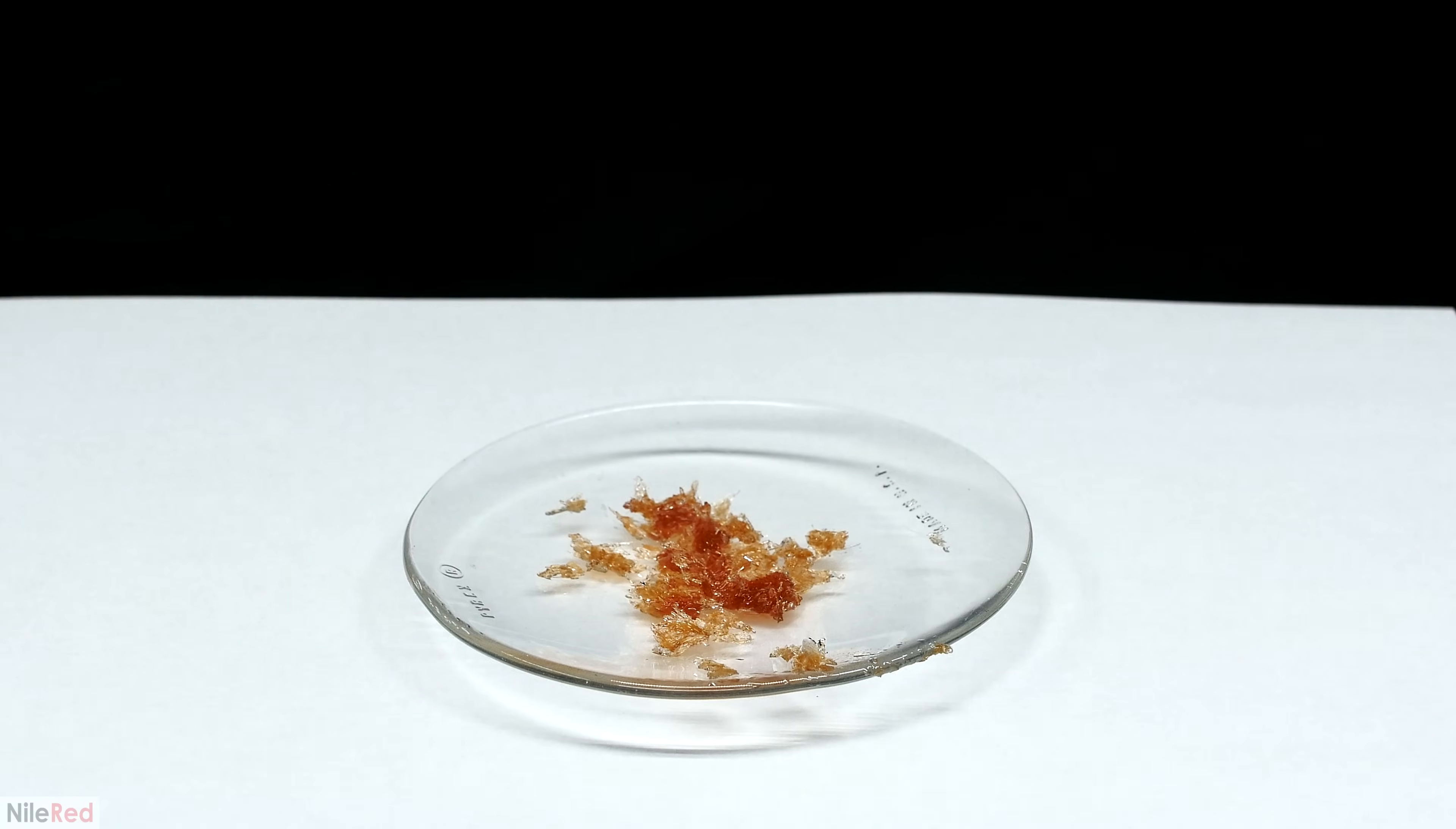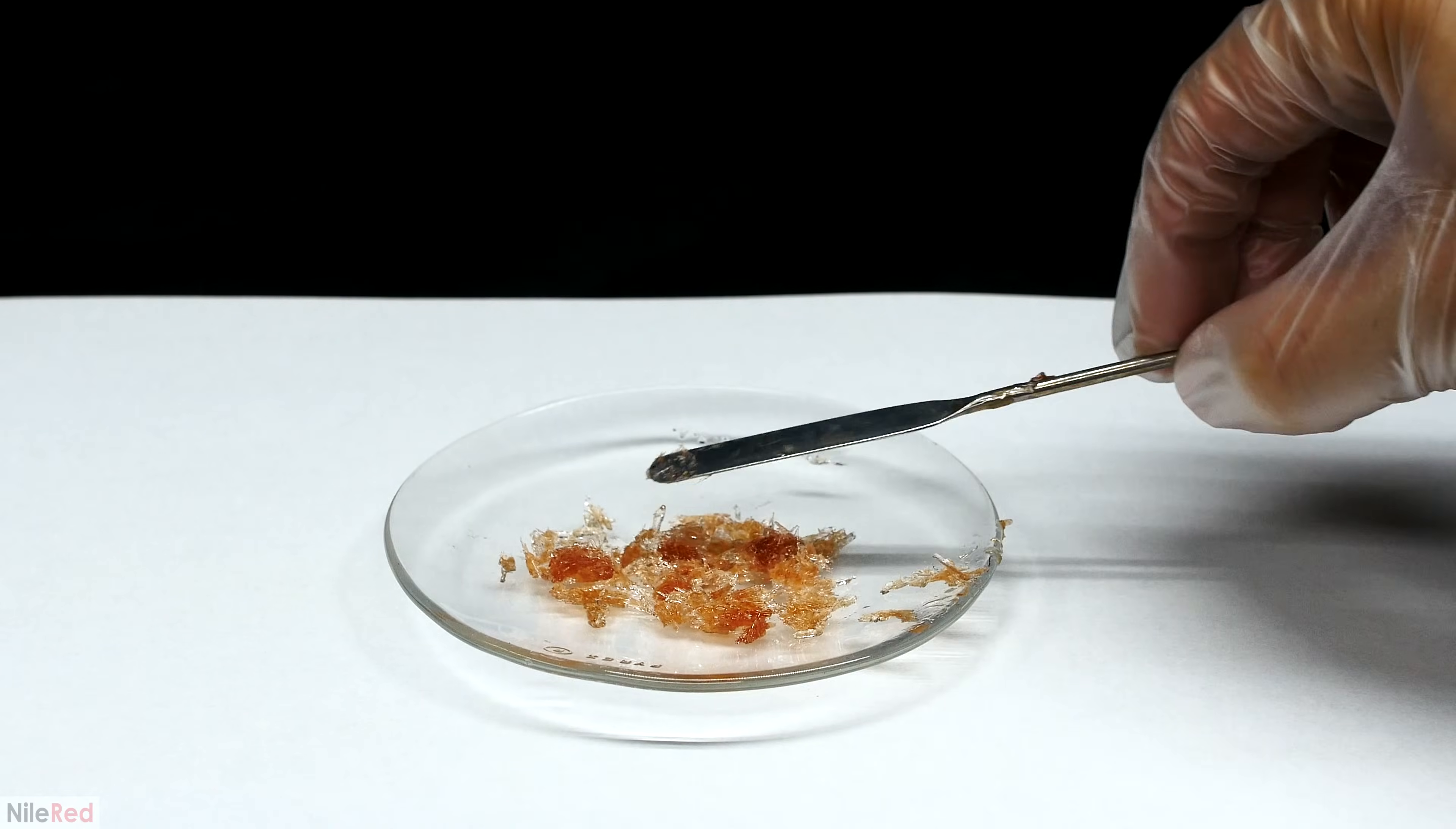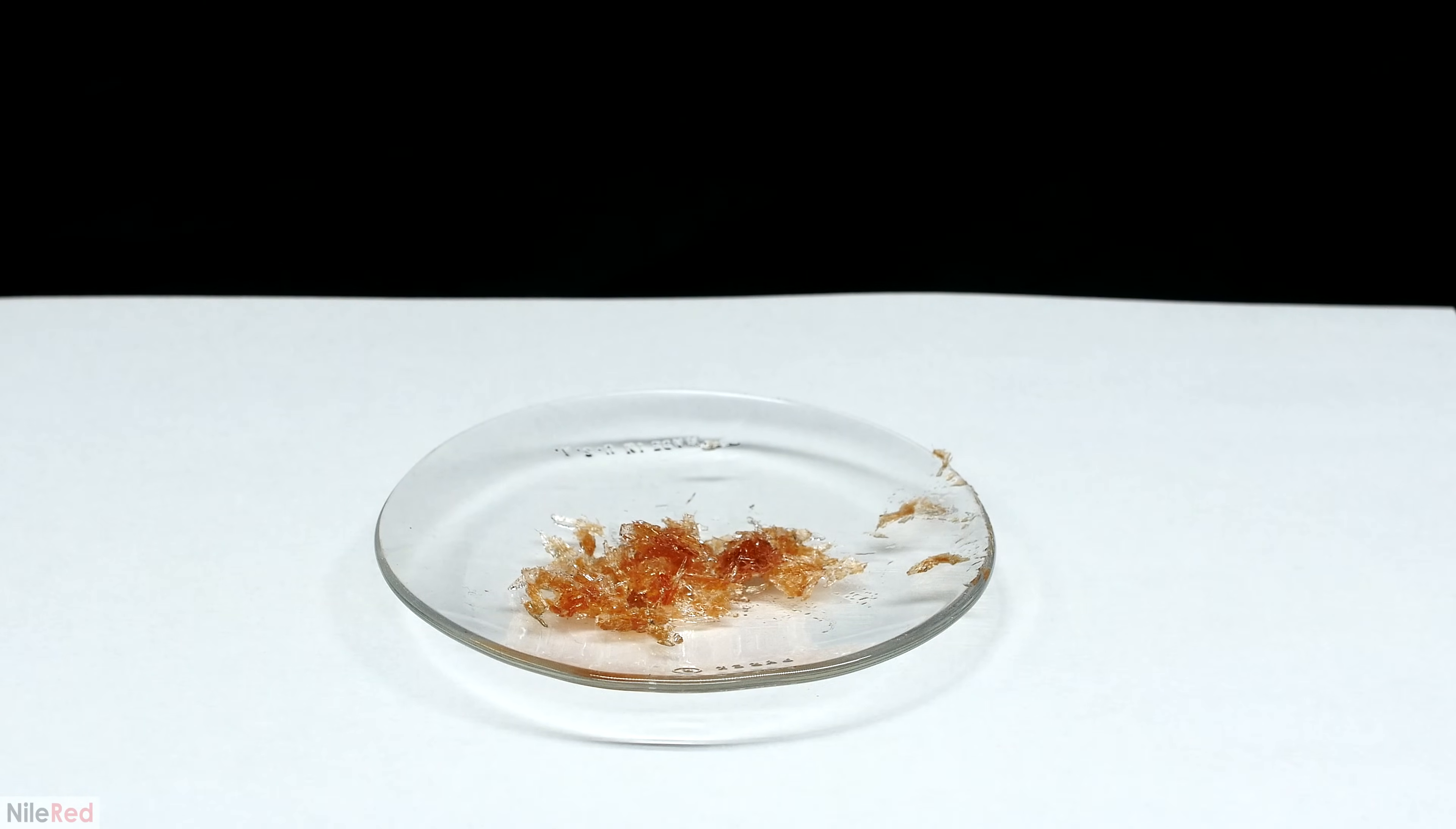Just by the color of the phenol that I have here, it's pretty easy to tell that it's heavily contaminated. The brown color indicates that we have polymerized phenol present, but we're also going to have benzoquinone and other oxidation products.